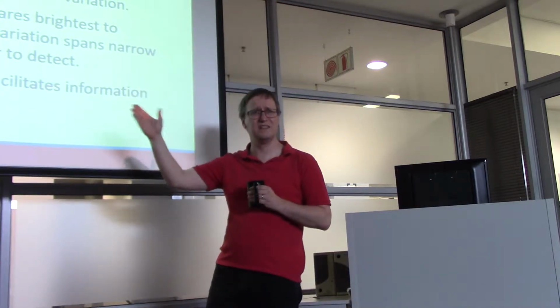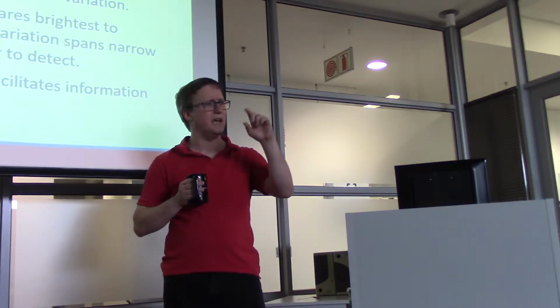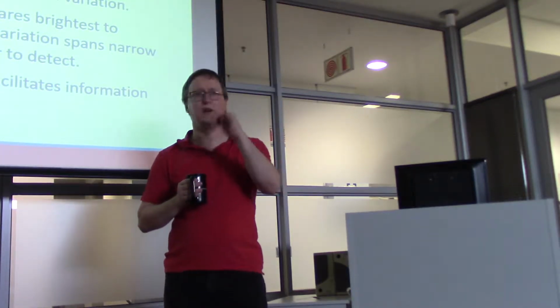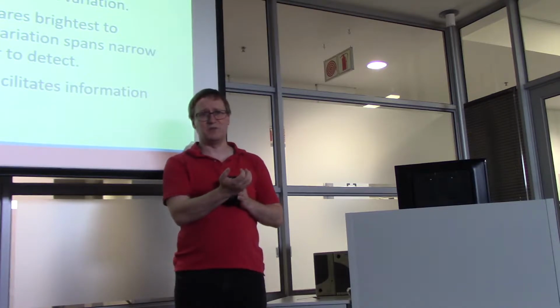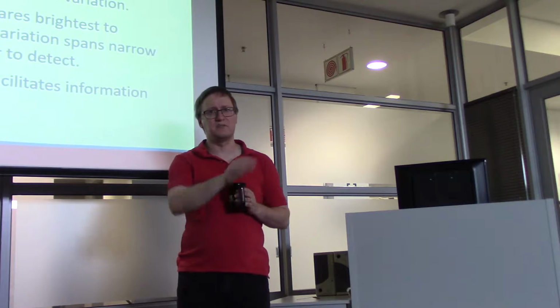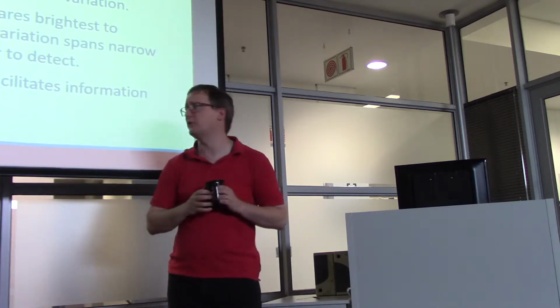Now, contrast is a big deal. I think folks are going to remember the image of a mite head that we were looking at yesterday. We looked at it in 1-bit, just black and white, 2-bit, 2 shades of gray plus black and white, and so on. Contrast gives us the ability to make out the details in these images. And the way in which the visual details spill out across the range of intensities that are available can make a big difference in our ability to retrieve information from it.